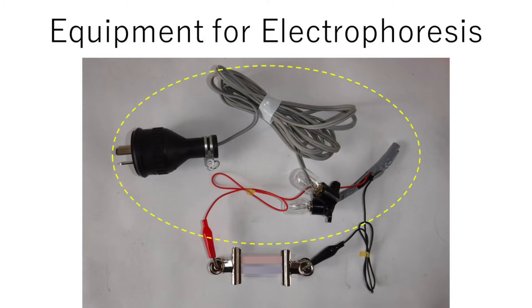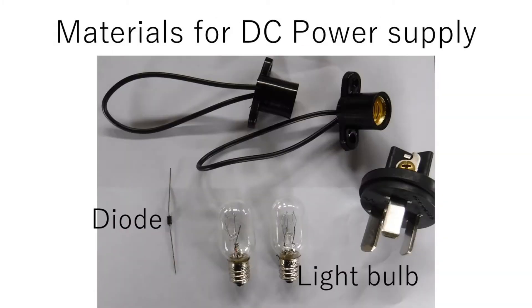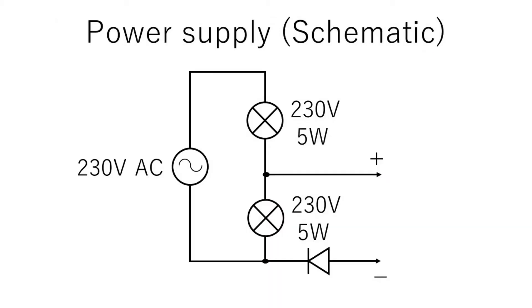A direct current supply of 50V is needed for electrophoresis. These are materials for making the DC power supply. This is a schematic of the DC power supply.